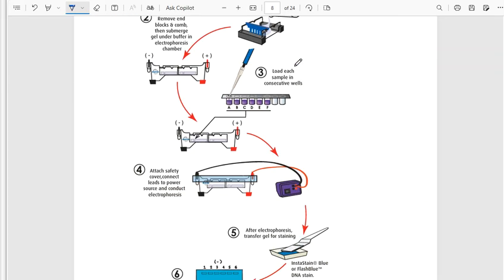So up until this point, we have taken all of that for granted. So those samples that we injected in our lab video, those were already taken from the crime scene or from the suspects. Those were already PCR'd by the time that we got a hold of them. And it was just really up to us to inject those samples into a gel and then begin to analyze them and undergo electrophoresis with them. So that's what we did here.